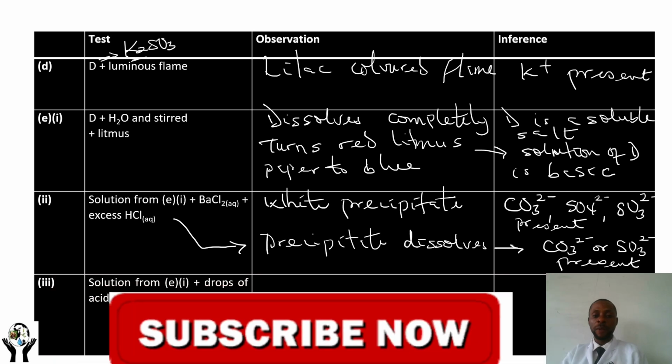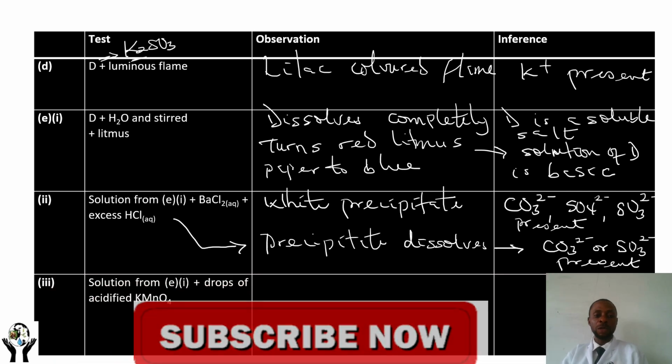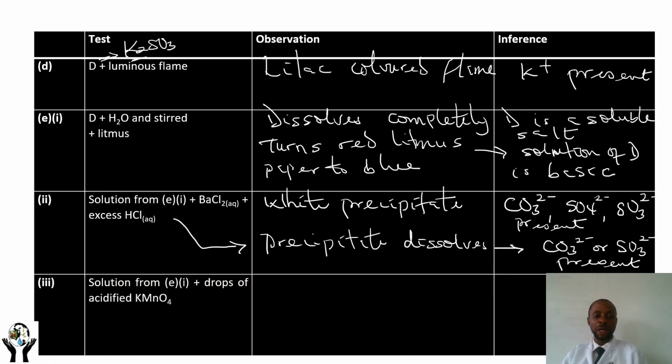So now, when you take the solution of that particular sample again and you add drops of acidified KMnO4, the acidified KMnO4 is actually purple in color.